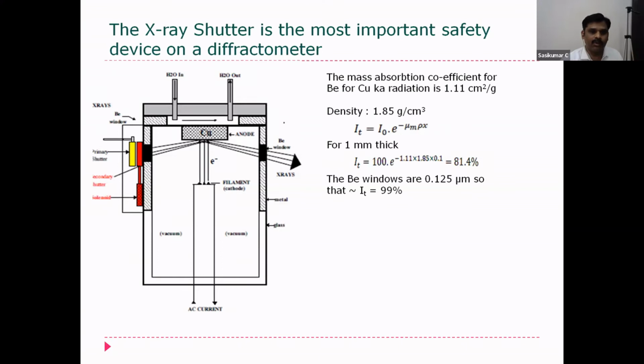So when you are working in an X-ray room, you should be very careful and be aware of how much X-ray is emitted. It is always recommended, when X-ray machines are installed in any location, that there should be a counter that indicates the X-ray level in that room. Still, we are taking all safety measures in X-ray.